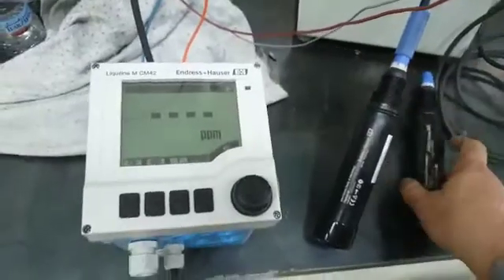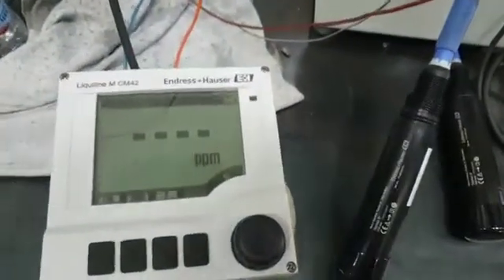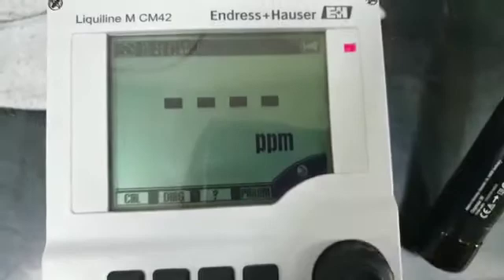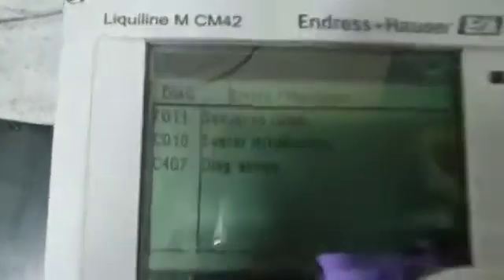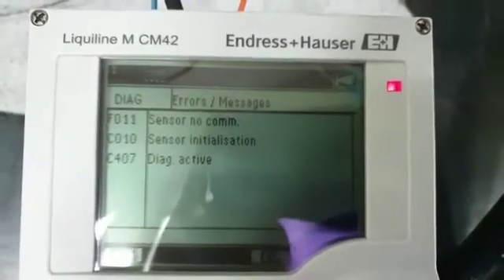Now it's connected — see what will happen. It's locked and look what is happening to the transmitter. I check the diagnostic and look at the reading: sensor no communication, sensor initialization. Let's wait till it's initialized.